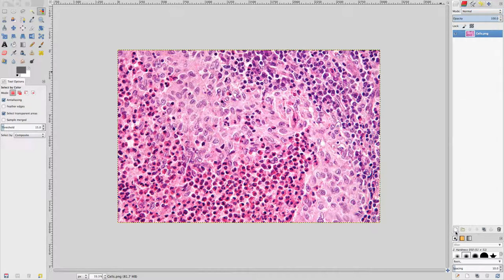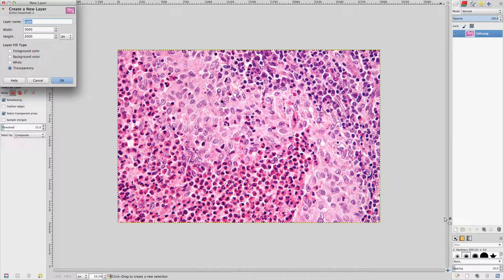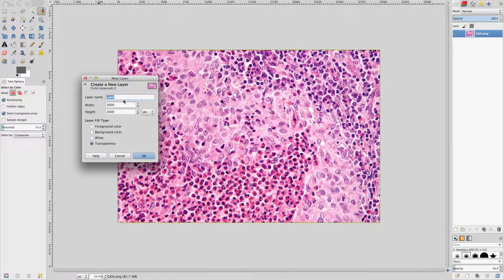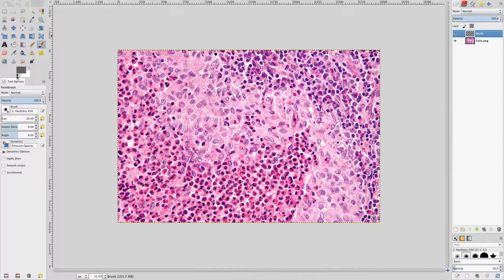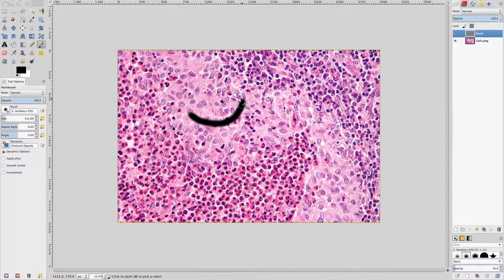Click the Create a New Layer icon at the bottom left of the Layers dialog. In the New Layer window that appears, make sure that the layer fill type is set to Transparency. Set the layer name to 'brush', then click OK. In the Layers dialog, a new layer appears above the cells.png layer. Select the Brush tool. Set the foreground color to black using the color reset swatch. Set the brush size to around 100 in tool options, then click and drag to paint some black pixels.